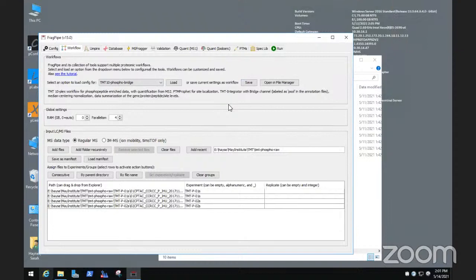And the final question is about normalizing PTM abundance to the protein abundance. I think you already mentioned that right now FragPipe doesn't do it. That's something you have to do with the report yourself. Let us conclude, if we don't have other questions here. It's a lot of great questions.